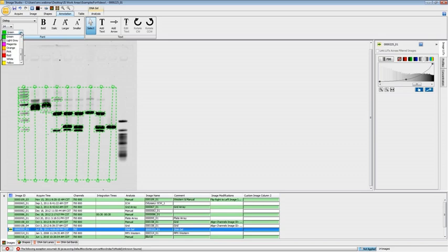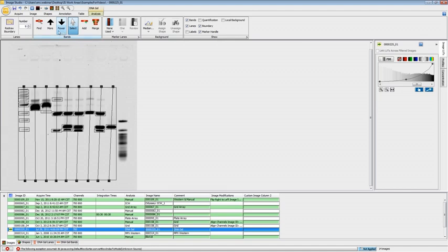What I did is I highlighted everything, and under the Annotation ribbon, I'm going to choose a different color type on here, just to make things a little easier to view. And so if using the Find, if it doesn't give you exactly what you need as far as the number of bands that are on here, you can click More to have it find more bands or fewer.